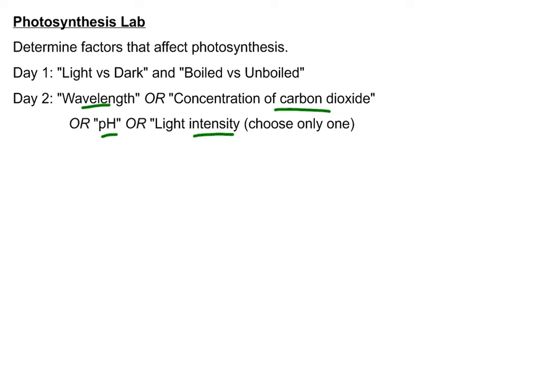You are going to be responsible for coming up with a procedure. However, before you get too far in your procedure, I would definitely suggest you talk to me to make sure that what you are trying to do can be accomplished with the materials that we have. Now, how are we going to be determining what's our dependent variable? The truth is, how we're testing if photosynthesis is occurring or not is by the light reaction.